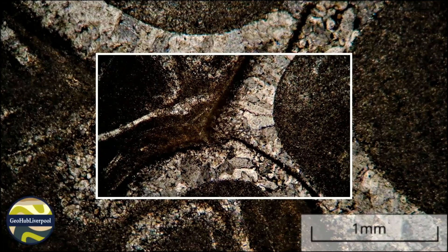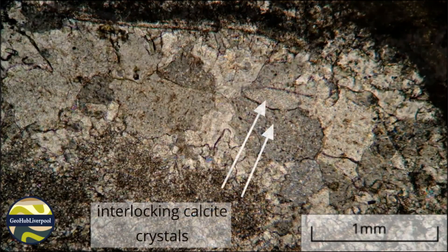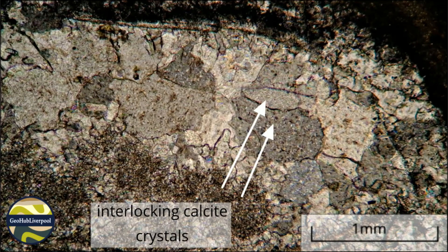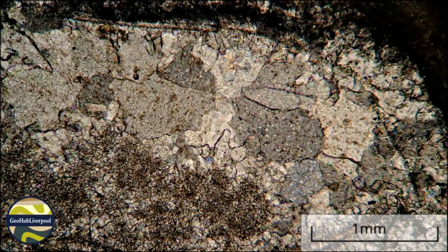No internal structure is shown in these skeletal remains. The shell was originally made of a form of calcium carbonate called aragonite. This was dissolved out and the void filled with calcite, which is another form of calcium carbonate. These interlocking crystals of calcite are described as drusy sparite. The crystals show an increase in size from the outer edge towards the middle of the larger bioclasts.